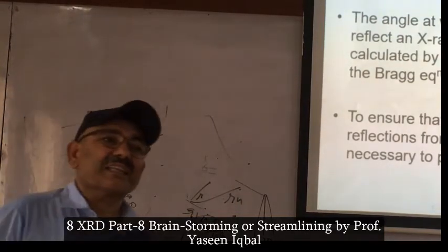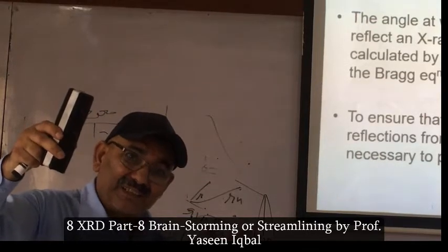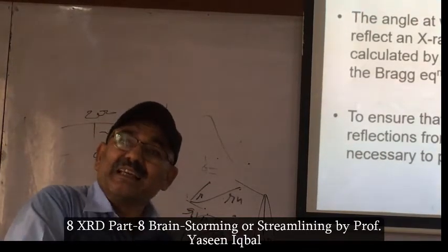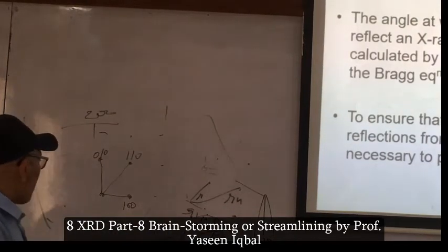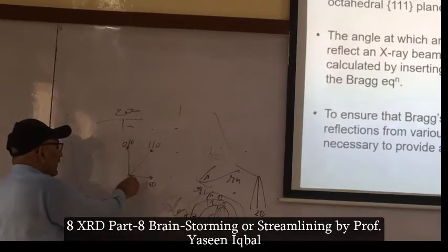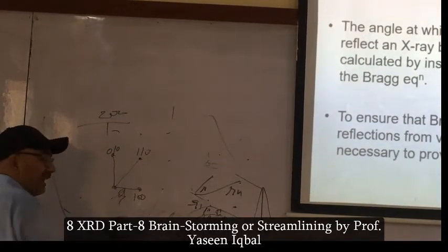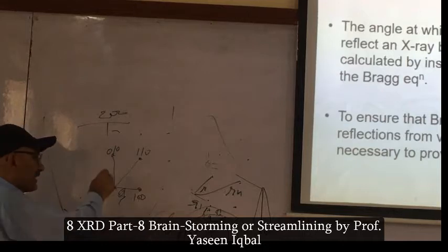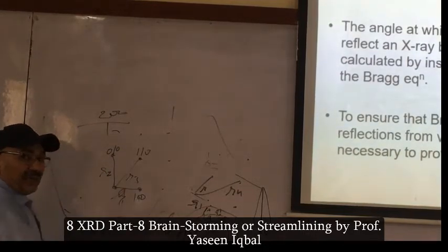We are talking in the reciprocal space. When the distances are large, this means these planes are nearer in the real crystal. Right? So that is why people don't call it D-spacing. People call it R-spacing. Reciprocal lattice vector, R1, R2, R3.